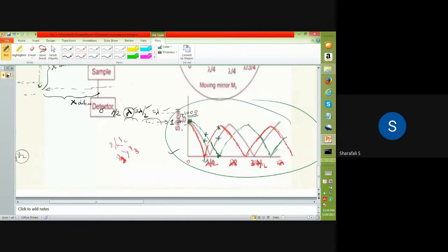So if you add all those intensities at different points, we will get a very complicated kind of aspect. That is what will happen when you have many frequencies, because we are not dealing with a particular frequency. In an FTIR spectrometer, we consider from 400 centimeter inverse to some 4,000 centimeter inverse, and below also, even starting from 200 or 0 centimeter inverse. Normally some hundreds or 40 centimeter inverse also.